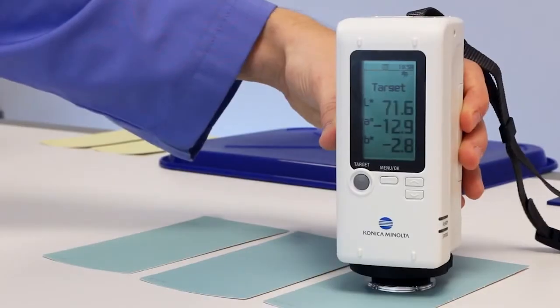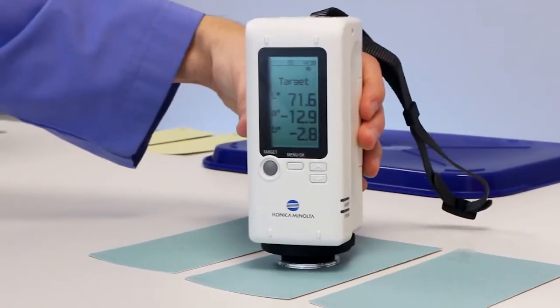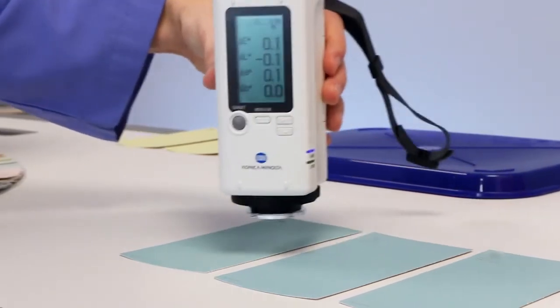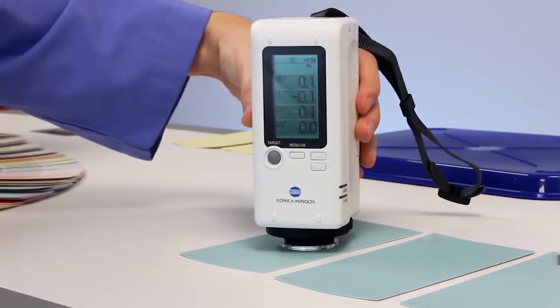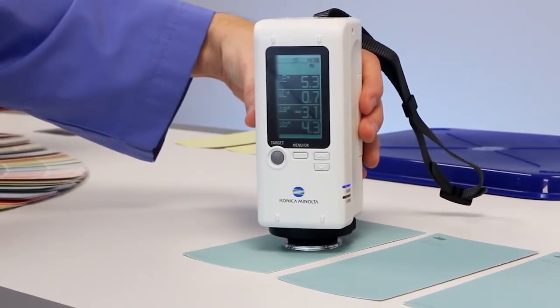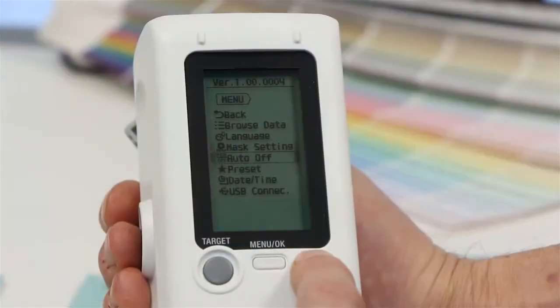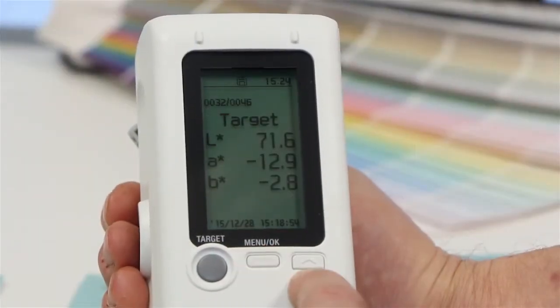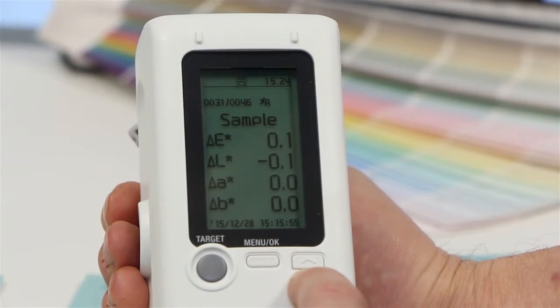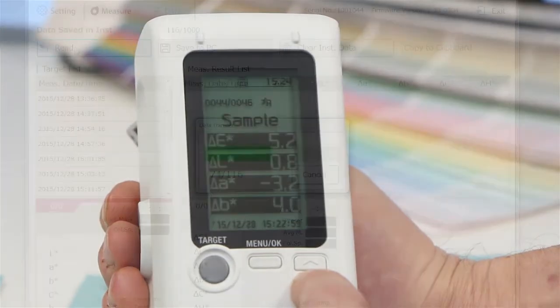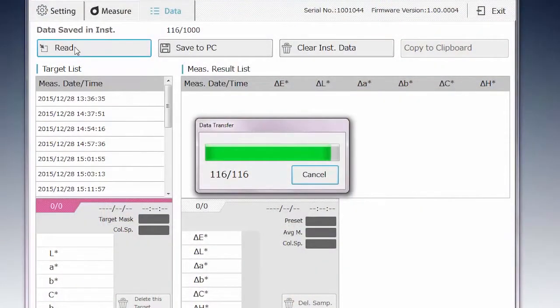You can store 1,000 readings, a combination of target and sample data. You can also upload this data into the utility software and paste into Excel for further analysis.